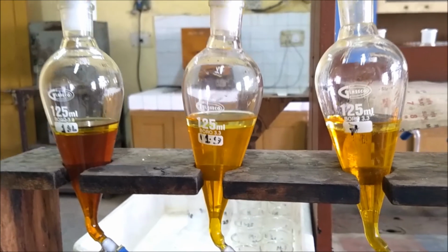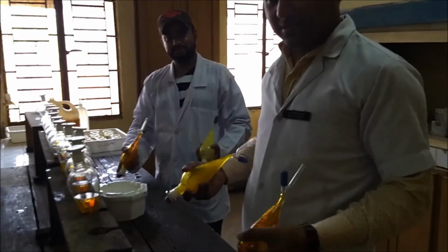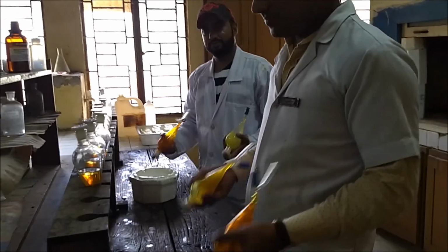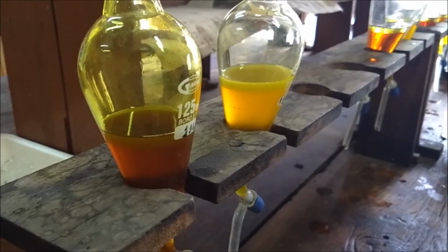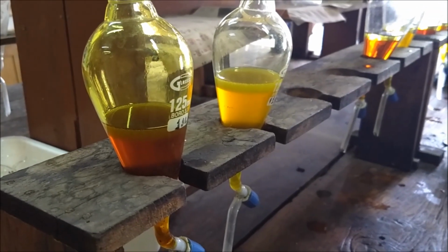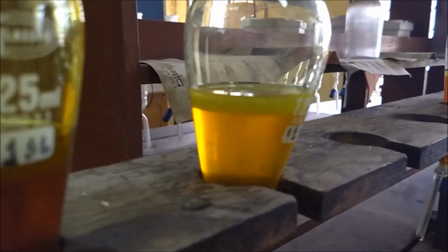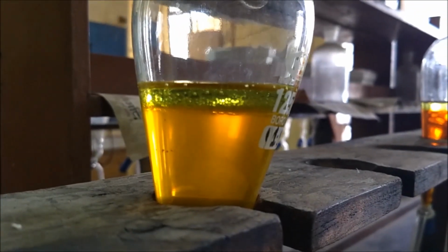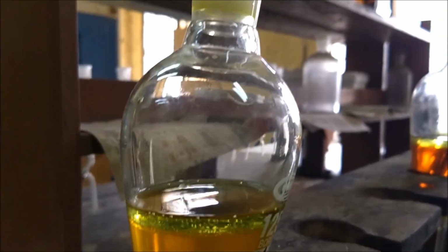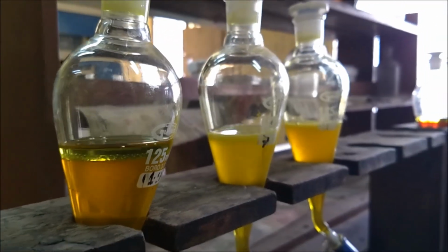Now, close the lid and shake the funnel vigorously for 2 minutes as shown. Then, place the funnel on the stand, and after some time you will see that the two layers are being separated, and you will observe that there is a change in color in the organic phase as iron and gold particles have come into it.